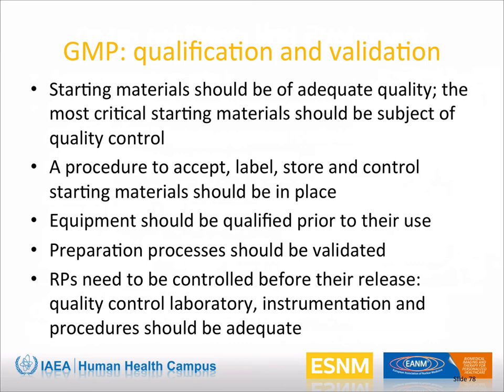GMP states that equipment should be qualified prior to their use and preparation processes should be validated. A very critical point due to the radioactive nature of radiopharmaceuticals is that radiopharmaceuticals need to be controlled before their release.